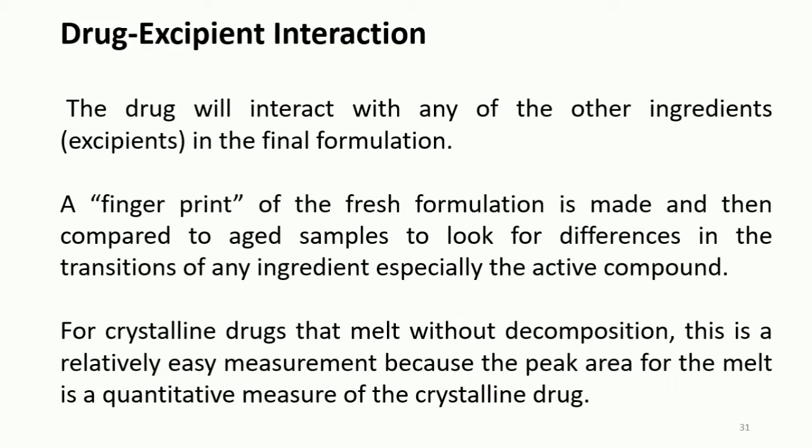For amorphous materials that are often miscible with other amorphous excipients, or for crystalline drugs that decompose instead of melt, the measurement of drug excipient interaction by differential scanning calorimetry is somewhat difficult.